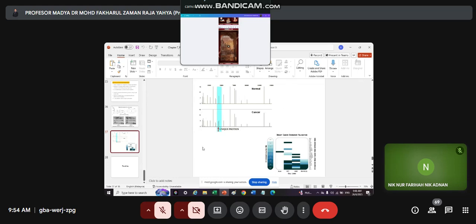Okay, from MS, we can see the unique mass spectra. So the unique ones represent the abnormal expression of cancer biomarker. Okay. So the same approach can be used in other types of cancer, for example, breast cancer, and we can monitor the biomarker expression using MS analysis.